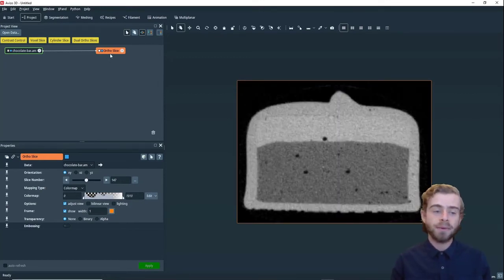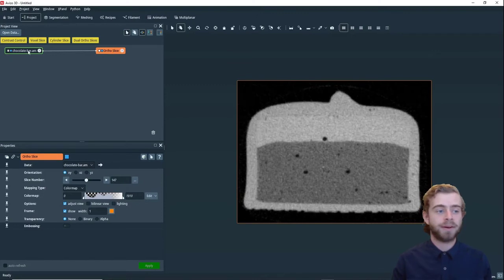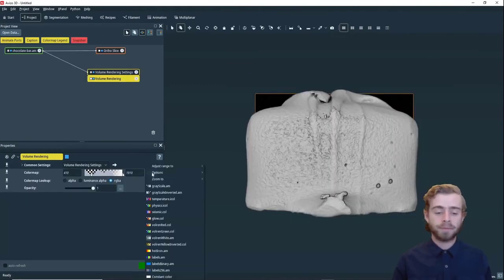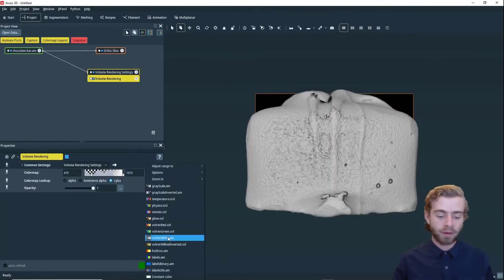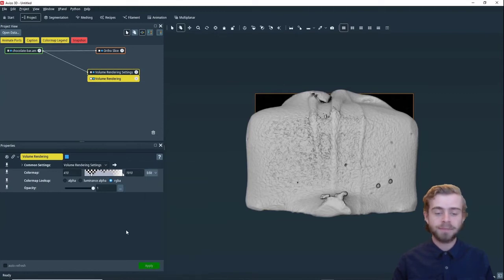So next thing we're going to do is we're going to create a volume rendering. So Avizo automatically applies a Valoran white color map to this.